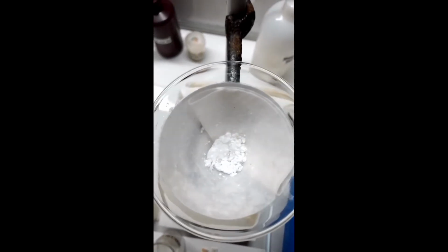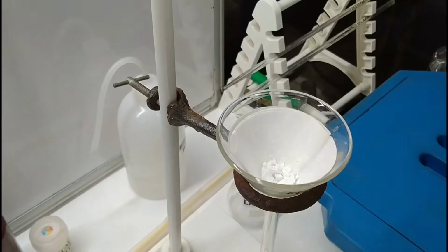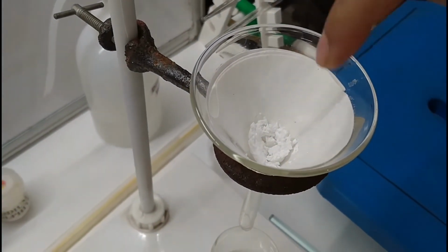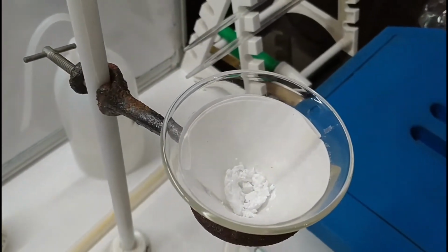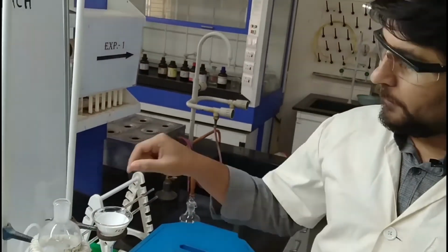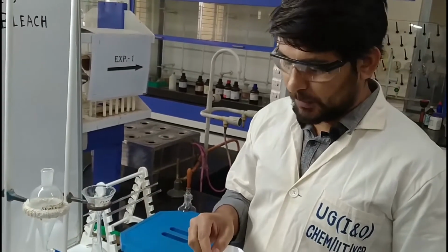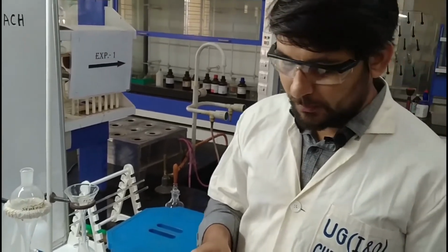So this is the benzoic acid gathered in the center of the funnel. Students, now you can see all the prepared benzoic acid is gathered at the center of the filter paper cone. Our next work is to remove this from the funnel, then dry it, and then take the weight of the prepared benzoic acid.